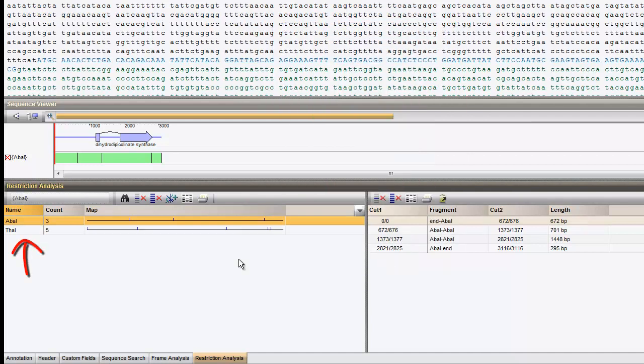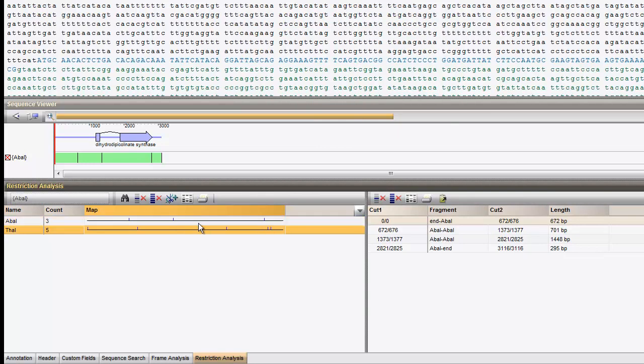The second enzyme is added to the left panel. I will as well map this enzyme onto the sequence.